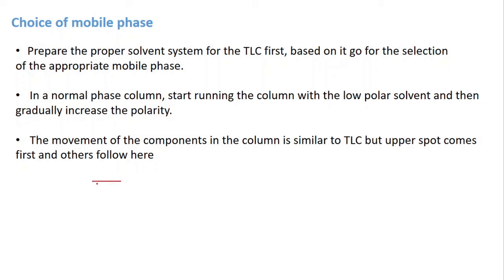Suppose you have one chemical mixture. You want to separate it after the reaction, you want to purify it. This is a reaction mixture. You have run the TLC up to this solvent front, and now after running, you have three components. Please note that in TLC you may not get very good separation of the three components. They might merge, so you may have to come across all these problems.